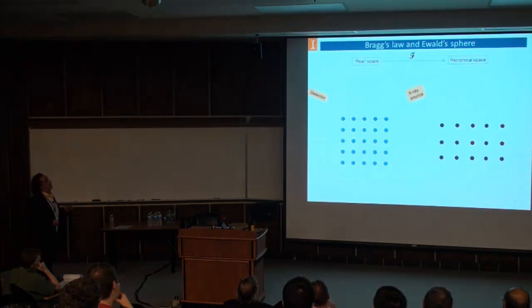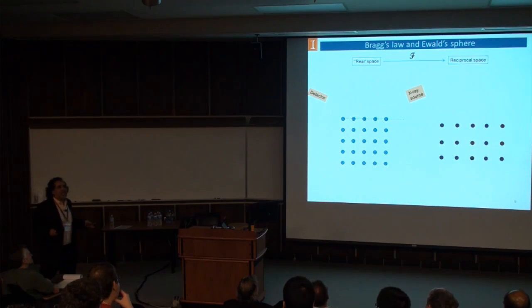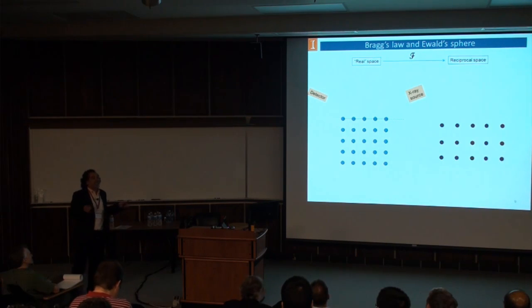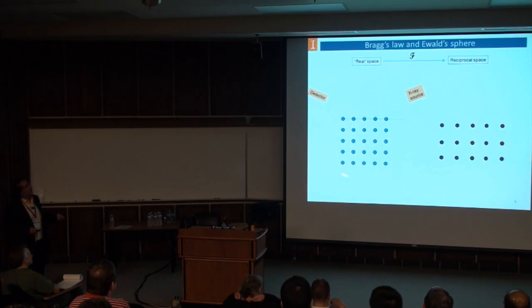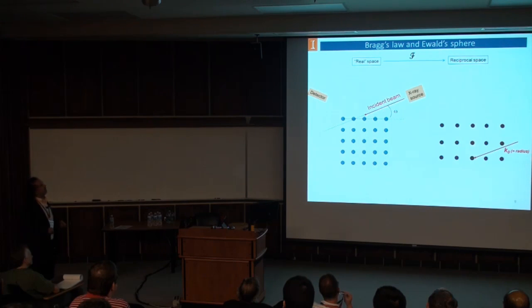All right, so now it is actually the holy grail. If we had to do an adventure movie about X-ray diffraction, Bragg's law would be like the Da Vinci Code, something very important. Here I'm going to show you Bragg's law, and also the corresponding situation in the reciprocal space. I'm showing both spaces, our space and the twilight zone kind of space. An X-ray beam comes into the sample at an angle of incidence, the diffracted beam goes out at the diffracted angle, the same thing, and we have wave vectors in the reciprocal space.